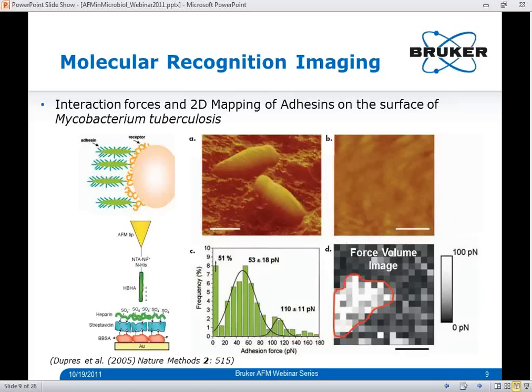Two types of experiments were conducted. First, force spectroscopy experiments between HBHA-modified AFM tips and heparin-modified gold substrates revealed two significant populations — one at about 53 piconewtons and the other at about 110 piconewtons — believed to represent the interaction of one HBHA molecule or dimeric forms of HBHA. In the second experiment, heparin-modified tips were used to map the distribution of HBHA molecules across the bacterial cell surface. The adhesion map showed lighter areas of higher binding forces, and it was found that adhesions are arranged in nano-domains on the cell surface.